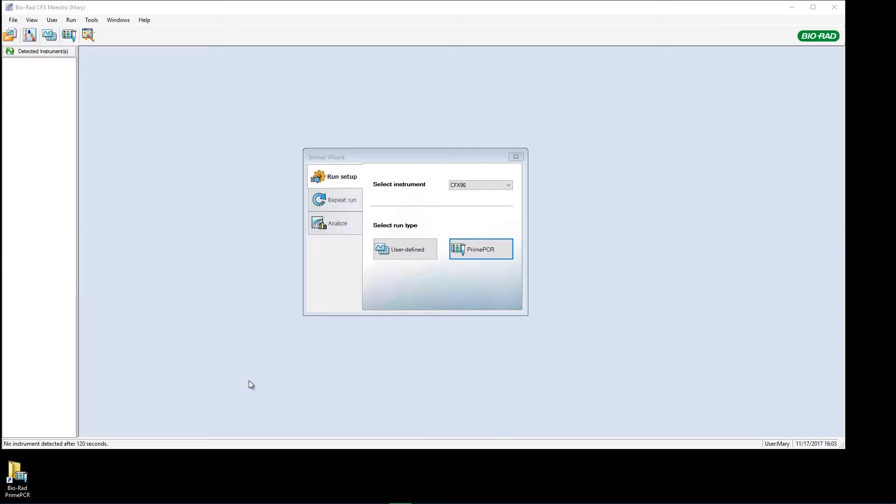That's the basics of plate setup. But today, I'm going to make things even easier for myself by working with a Prime PCR plate, which has a pre-designed layout and comes with primers already loaded onto the plate. Let's see how this is done.